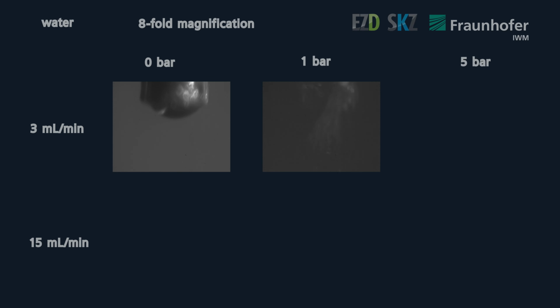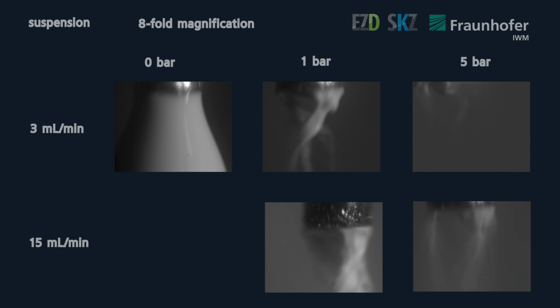We positioned the focus plane at the nozzle outlet, as this seemed to us to be the ideal focus point, but there were always water droplets in front of the focus plane, blurring the images. We moved to the alumina slurry system again.